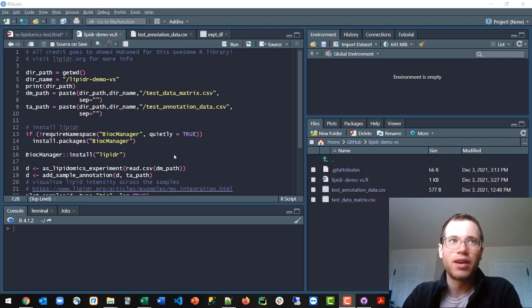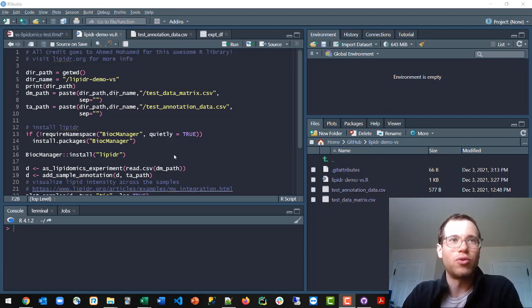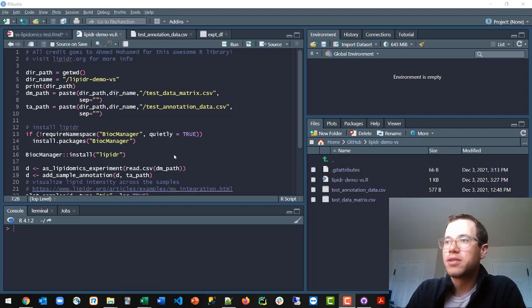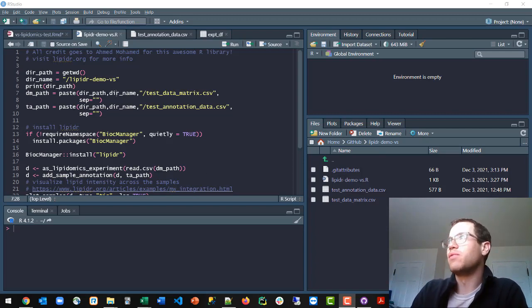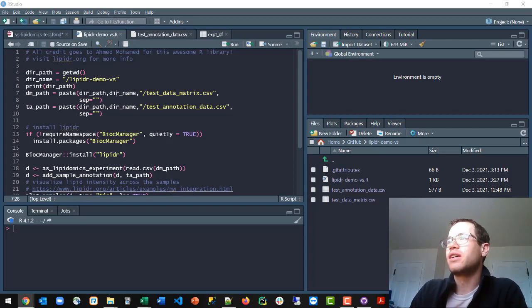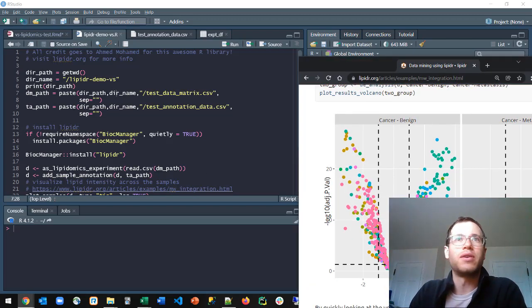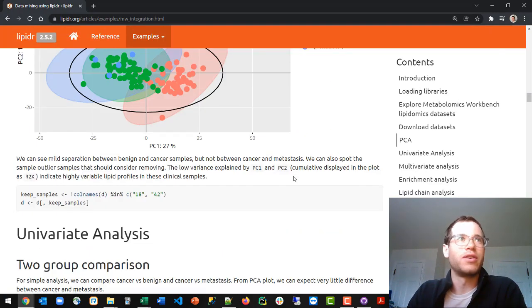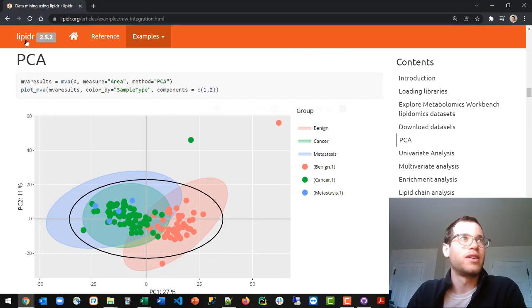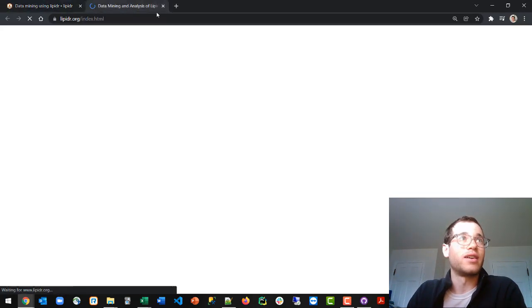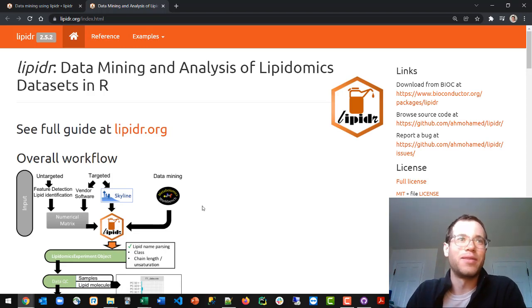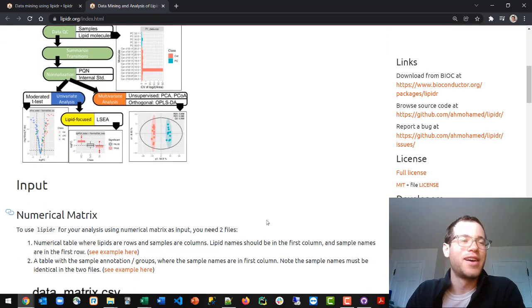It's a great tool. I'm going to walk through how to basically do what's on the website. If you haven't seen the website already, it's lipidr.org. It's a very nice website. I cannot give the author enough credit for this. So thank you, Dr. Mohamed, for all this.